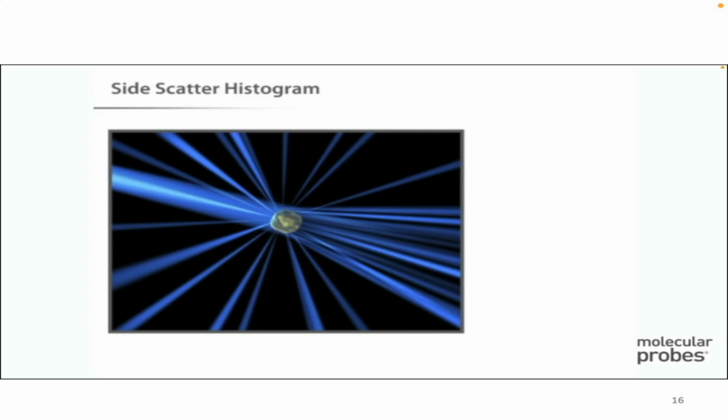This is one where I definitely need the video to give me a real drawing. I'm going to show you some things, and those of you who know some physics are going to be like, yeah, that doesn't make any sense at all. But that's because I can't draw. But basically, the idea is some cells have very few granules, don't have much stuff inside them, and some cells have a lot of stuff inside them, like a lot of granules.